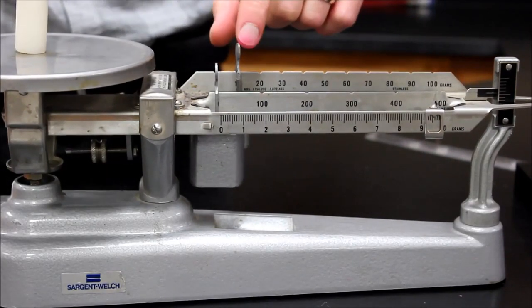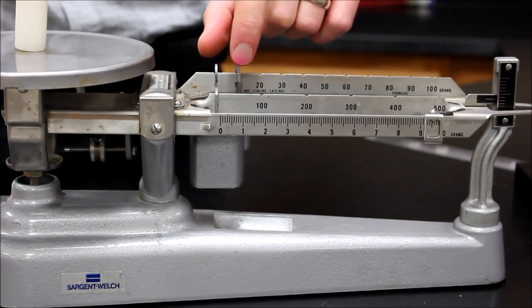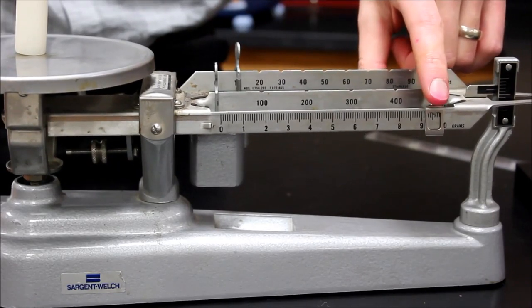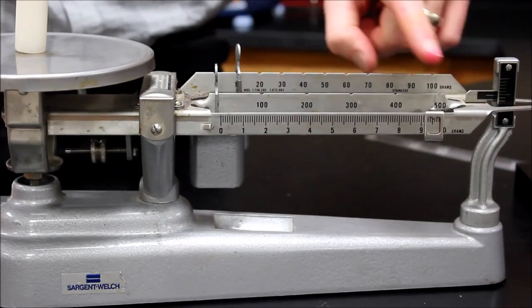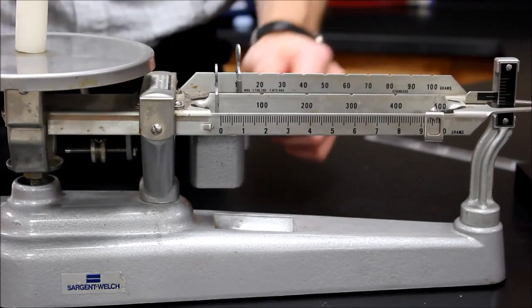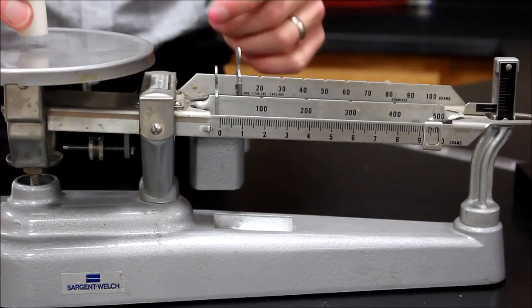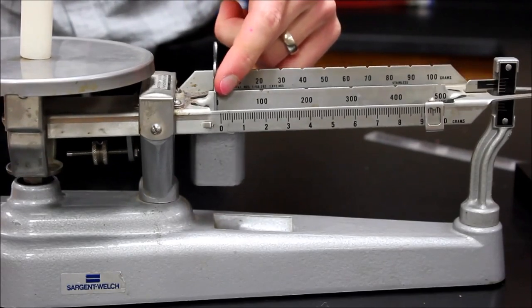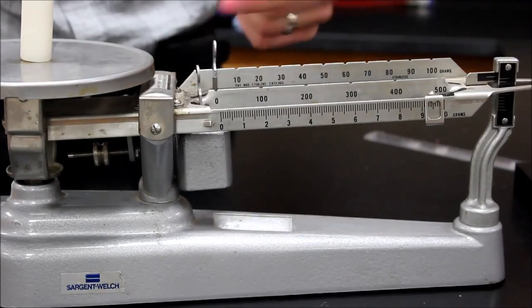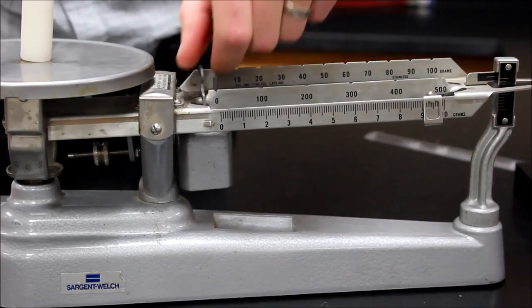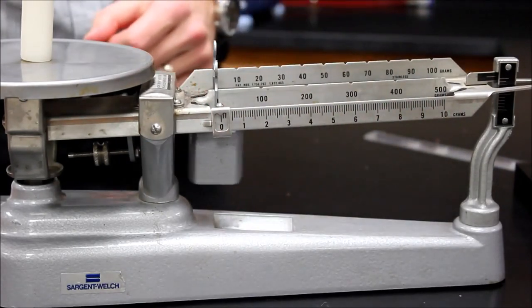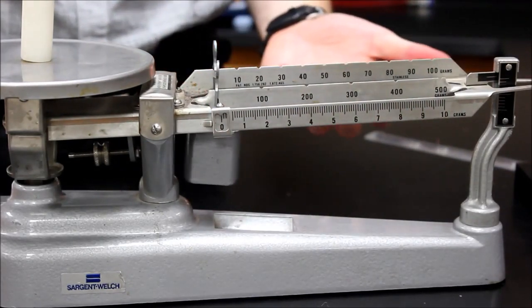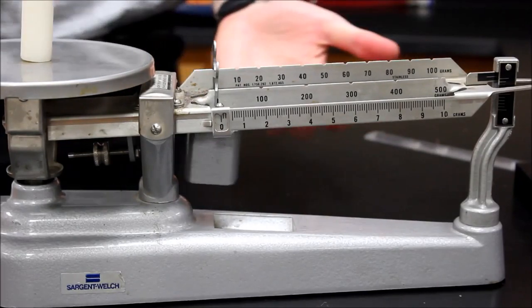I got that because I added 10 from this one plus the nine and a half. So 19 and a half is the mass for my candle. When I'm done I want to make sure that I put everything back to the beginning notches. Not too far or else it kind of messes it up here. Everything at the start. And now I write down my value of 19 and a half grams.